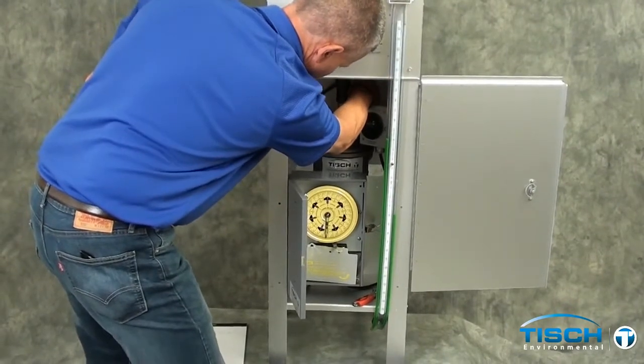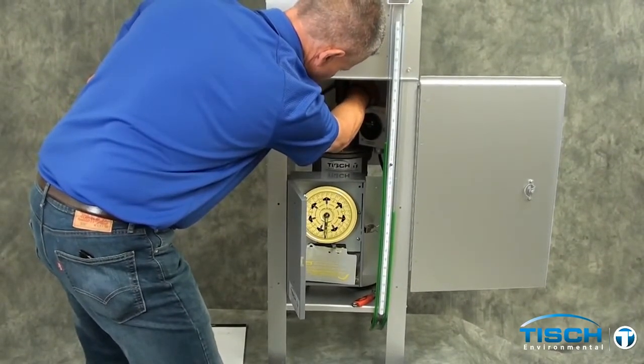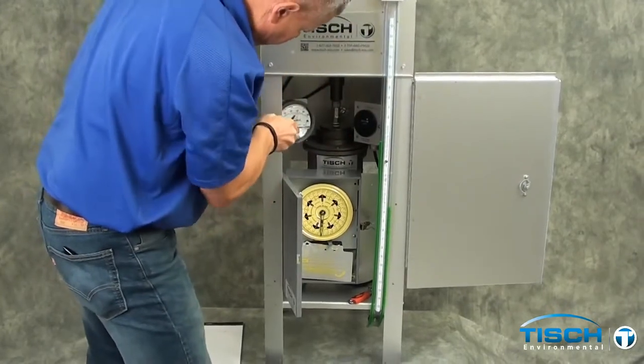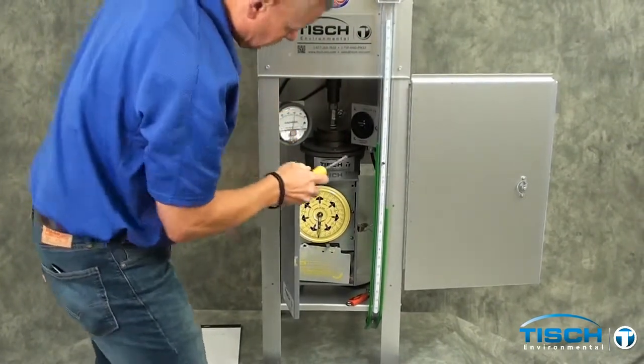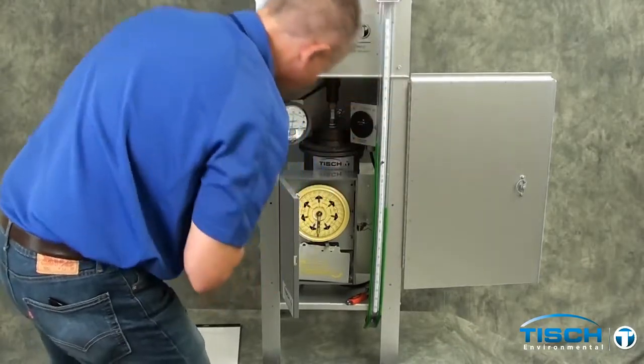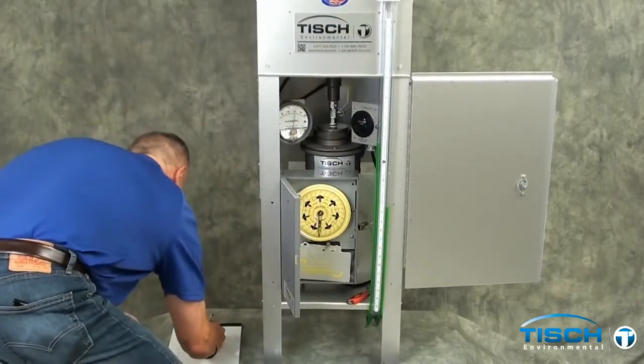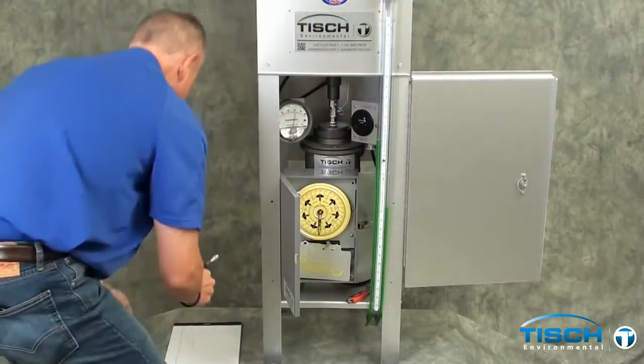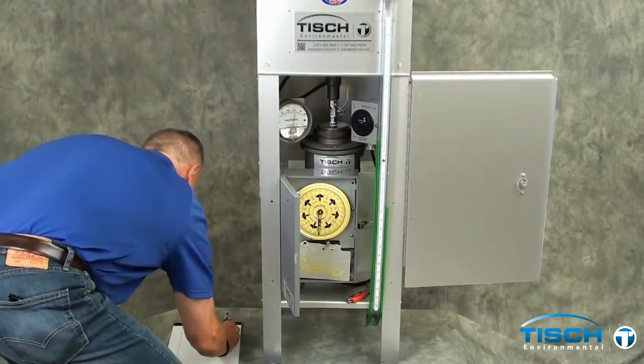Now move the ball valve away from you to obtain a reading of 60 on the magne-helic gauge. Then read the manometer again — in this case it was up 3.5 and down 3.5 inches for a total of 7.0 inches.